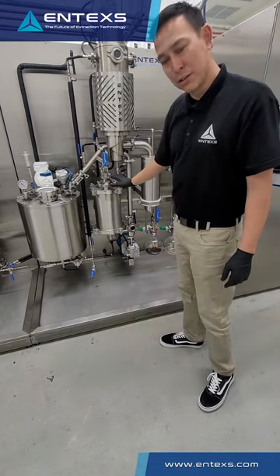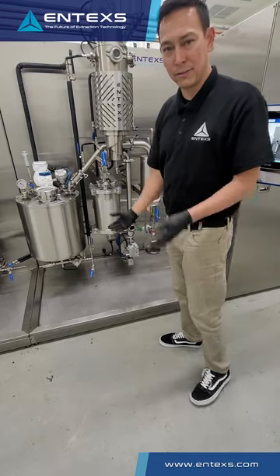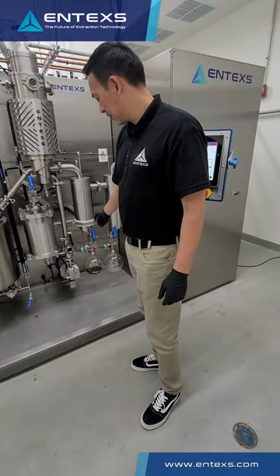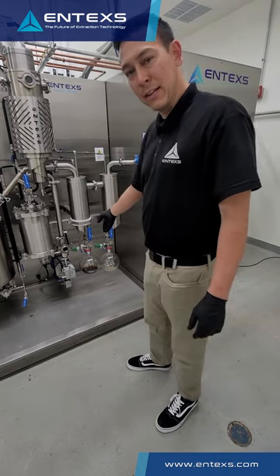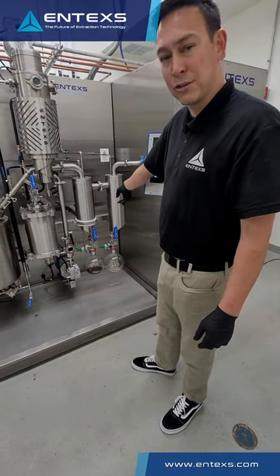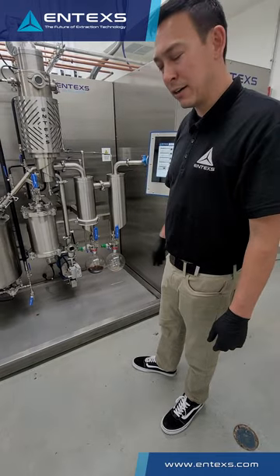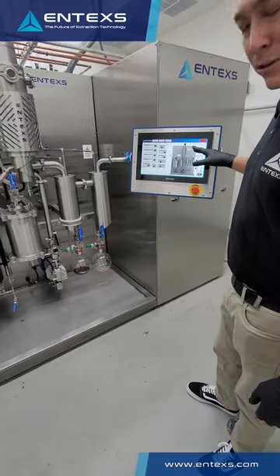We collect our residue in a vessel here and a waste container inside of it that you can discard — that's a very hard waxy waste product when you're running the process. We go into a dual cold trap system that condenses the condensables out on the first side using a glycol chiller. Then we have a liquid nitrogen cold trap to protect the vacuum system and allow us to pull really deep vacuum. We're pulling down to 20 millitorr with this piece of equipment.